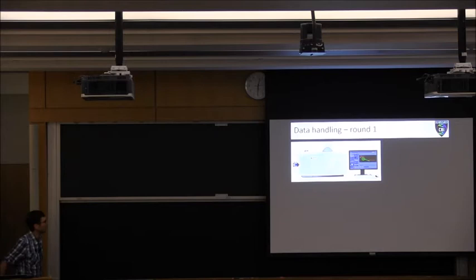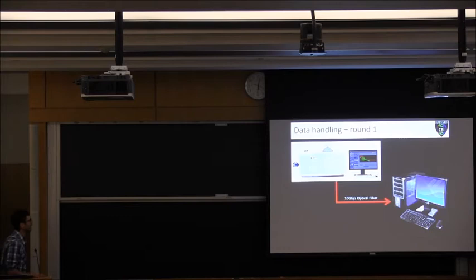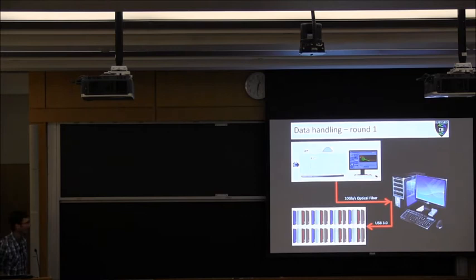Well, actually, when we started out, this was a total disaster. The original light sheet system that we had came with one computer. I think it had about 10 terabytes of storage on it, which when it showed up, this was 5 years ago, so that seemed massive. It was connected by this really fast connection. But we filled this thing up in a matter of days. And then I don't even know how many of these USB 3 hard drives we had that were just scattered around people's labs all over the place. This was the way we were doing it at first, so this was not sustainable at all.